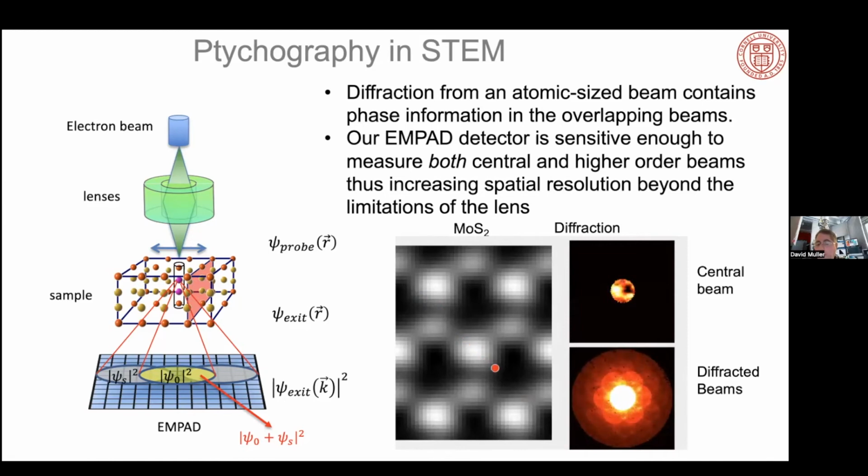That's the easy way to think of that, because we're going to come to it later, this is literally a map of momentum transfer. So this is just showing you where the probability current flow of the electrons are. And this momentum transfer can be related back to the force or potential acting on the beam. And so the bright spot is basically all of the electrons attracted to the nucleus of the atom. And as the beam moves around, the bright spot is literally pointing towards and telling you where the nearest nucleus of the atom is. So this is the information we want to work with when we do ptychography.